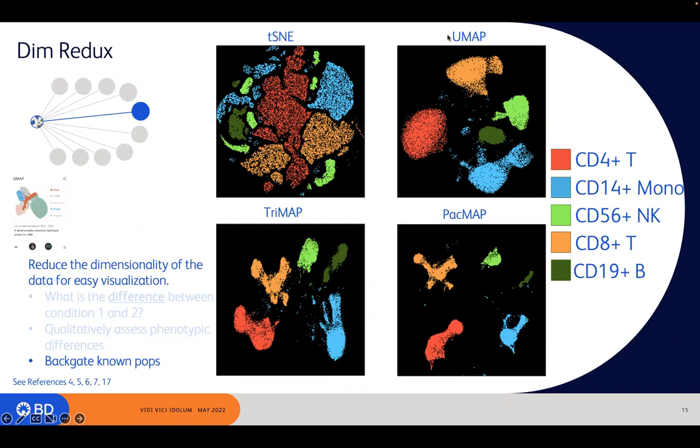I use t-SNE versus UMAP versus any of these others? Is there any advantage to using one versus the other? Which is better? Those types of questions. The basic answer to those questions is it's really a matter of personal taste. And I'll reduce it down here for you. All of the map, right?